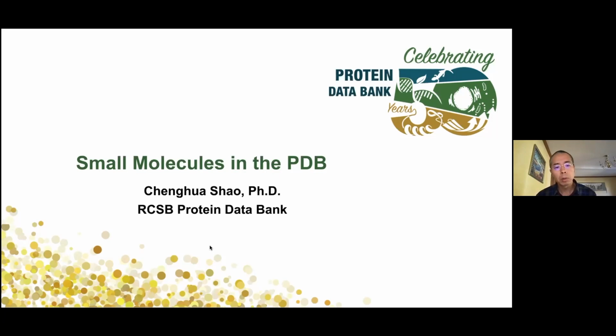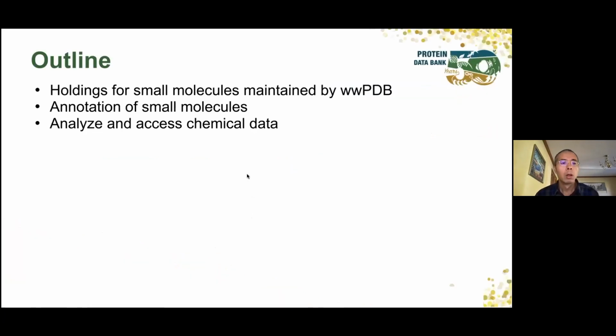So today I'm going to talk about small molecules in the PDB. We'll start with the introduction to the holdings of the small molecules in the PDB, and then I will talk about how we annotate the small molecules to ensure data accuracy and reusability. And finally, I'll talk about how to access and analyze the chemical data in the PDB. And shortly after this talk, we'll have a tutorial on that as well.